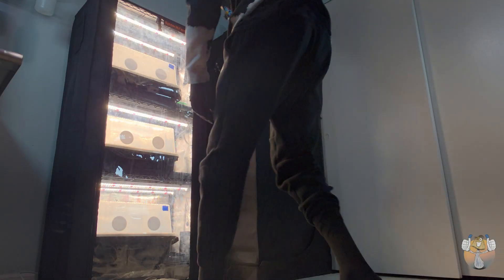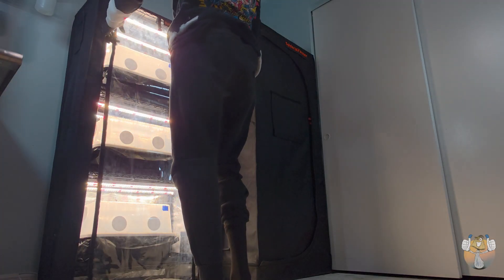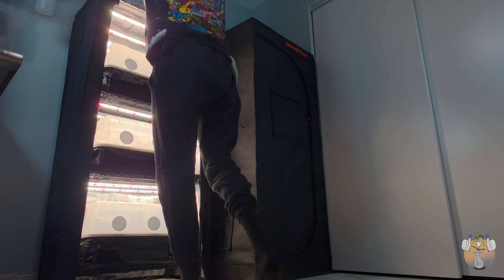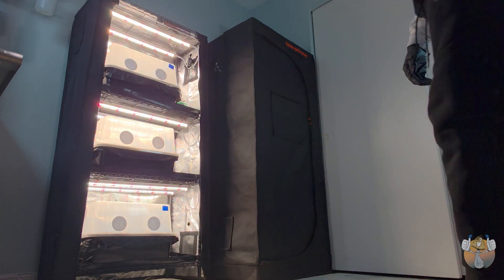Alright, Shroomies and Shroomettes, it's about that time. We're going to do a harvest on one of our mono tubs, and we are also going to be taking some spore prints. Let's get it.